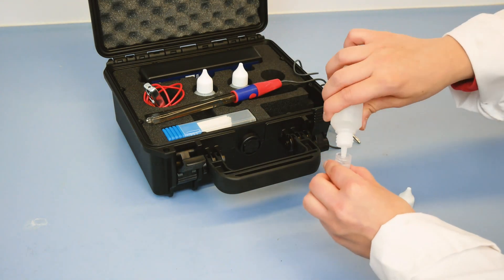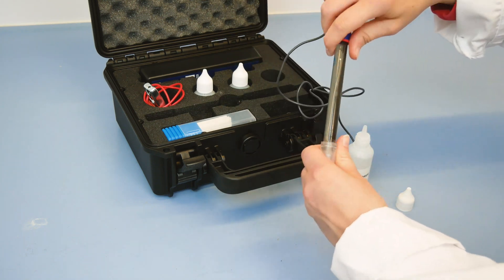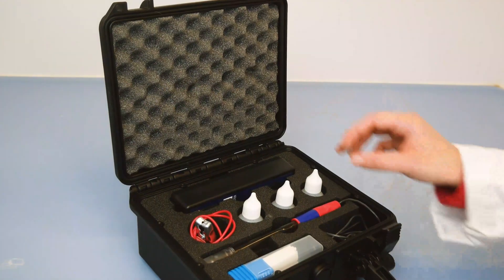The test is simple and fast. The unit is robust and has a long lifespan as long as the electrode is kept conserved with special fluid and the unit is returned for calibration once per two years.